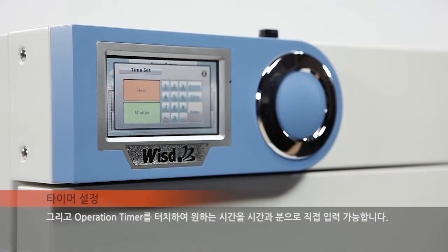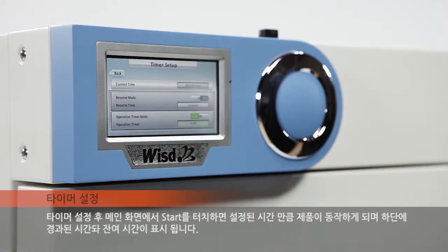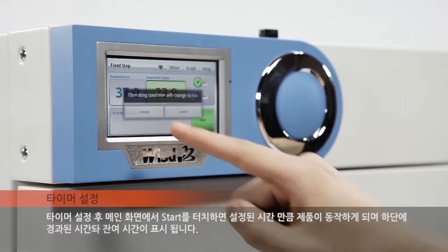Touching the operation timer allows the user to enter the desired hour and minute directly. After timer setup, touch the start button on the screen to start operating the device for the preset duration. The elapsed and remaining time are displayed at the bottom of the screen.